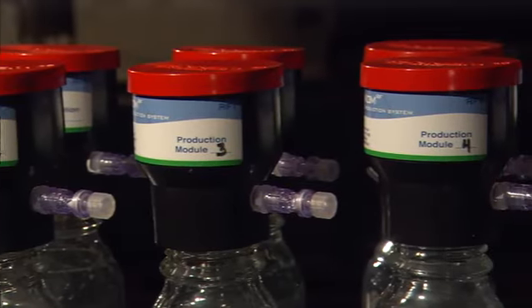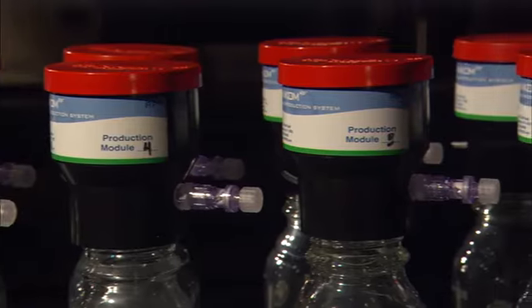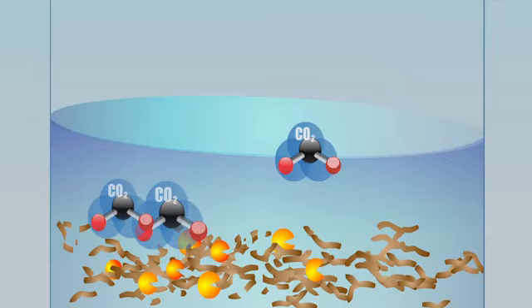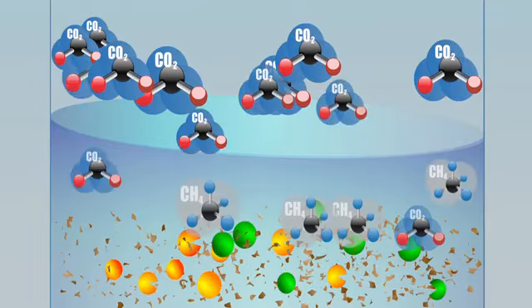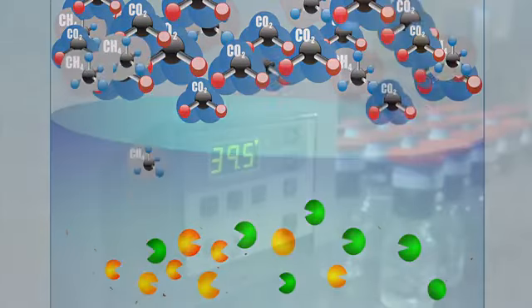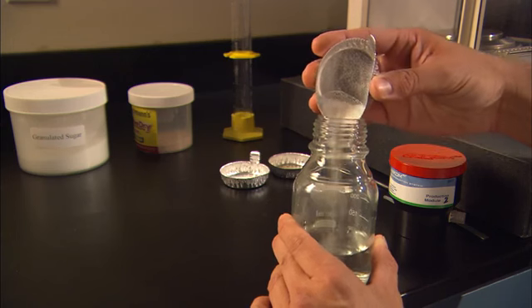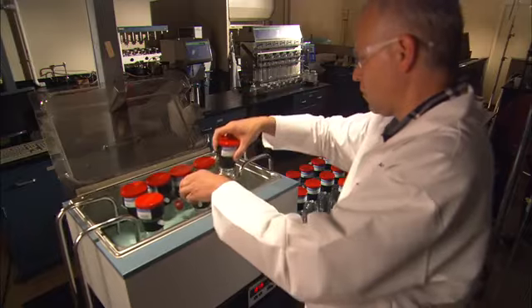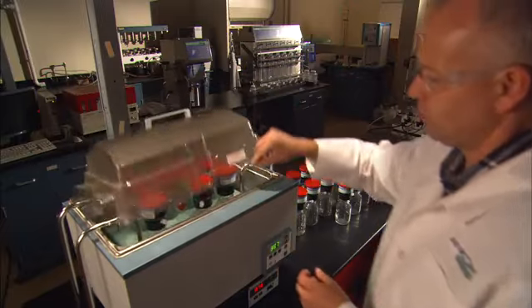The critical component of the RF system is the module used to contain samples in an anaerobic or aerobic environment. As microbes metabolize the substrate, various gases are produced. The type of gases produced will depend on a number of factors, which include the makeup of the microbial population and the composition of the substrate. Because the system allows the user to control the environment, the fermentation substrate, the microbial population, and the study variables, researchers can use the RF system to monitor gases produced over time with little intervention.